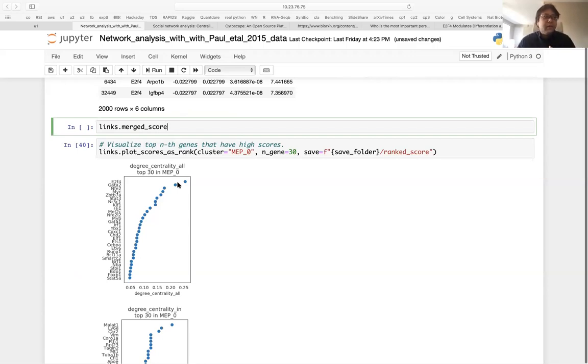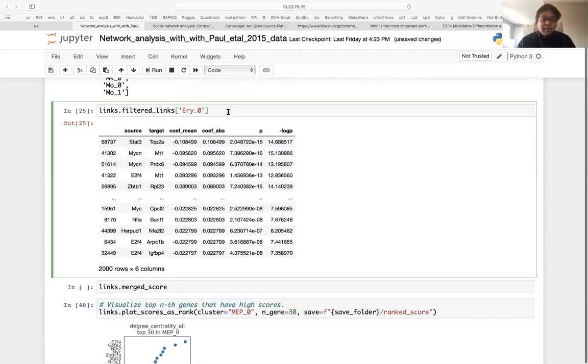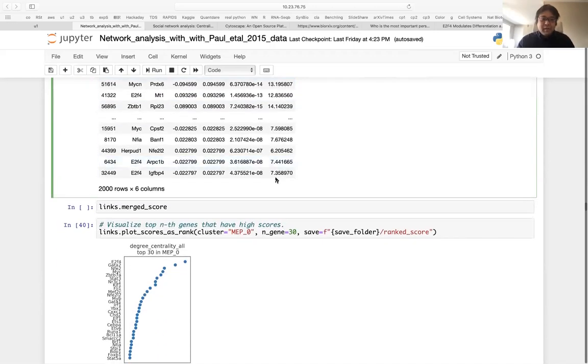We don't have any method to know the similarity here. In theory, we can export the network and calculate the similarity using two different algorithms. Yeah, it could be something worth exploring in the future if people think that would be helpful. Yeah, we can do that.